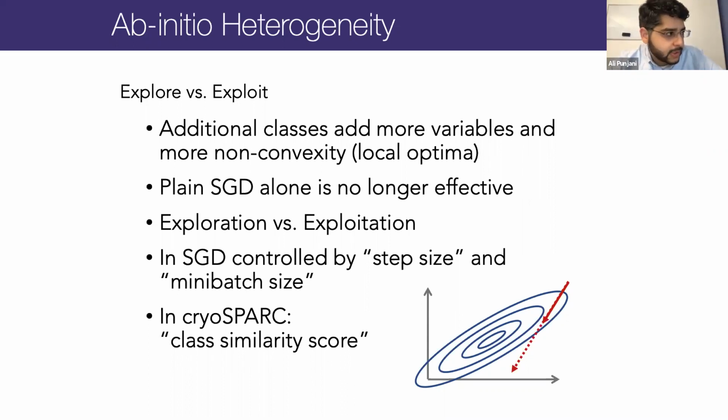So there are many different ways for the algorithm to resolve different results. And a lot of that comes down conceptually to this concept of exploration versus exploitation. This is a common sort of theme in optimization methods for this kind of problem, especially for any kind of clustering or search or learning type of problem.